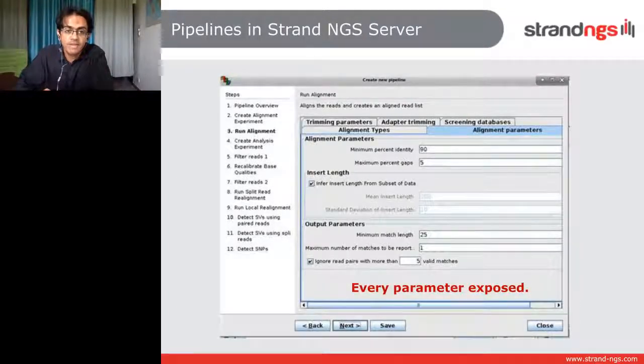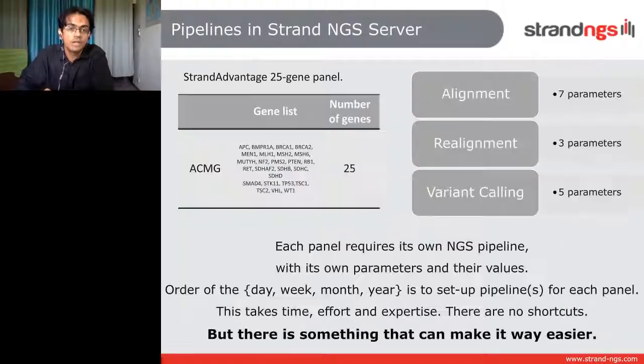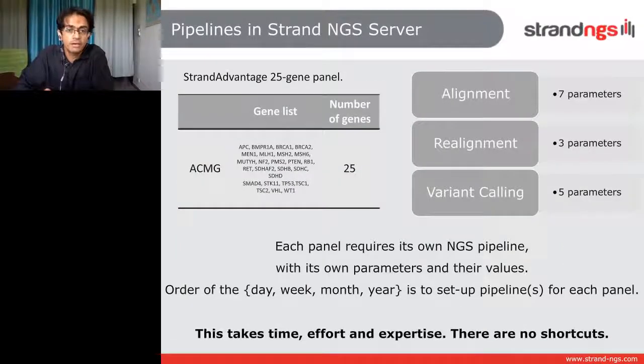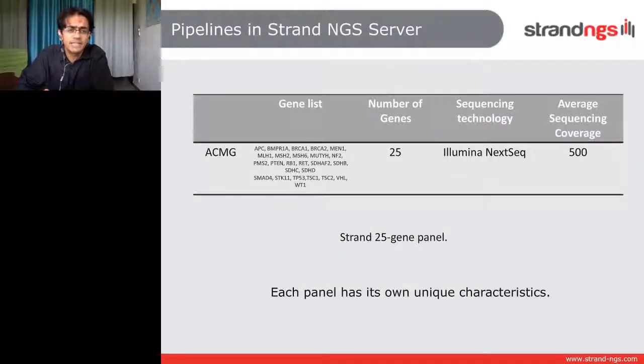And I think Strand and Strand NGS, server or otherwise, they're just doing a great job of being part of this huge conversation that began maybe 2 decades ago and is ongoing and needs to penetrate even further if we're going to make any dent in genetic disease. Strand and Strand NGS Server have done a great job so far, and it's an honor to be a part of this team.